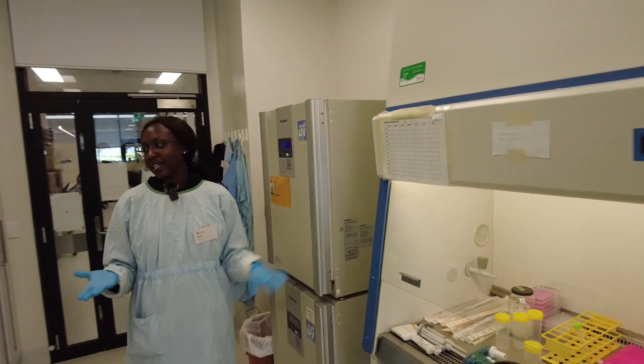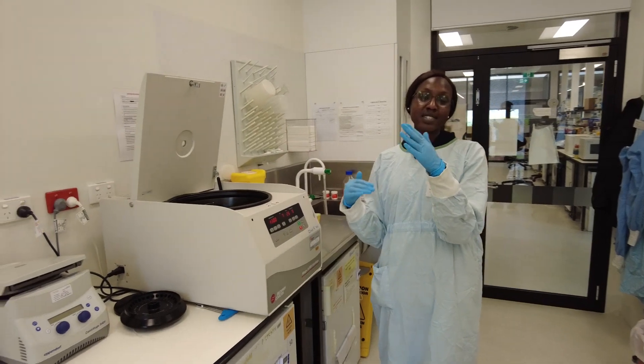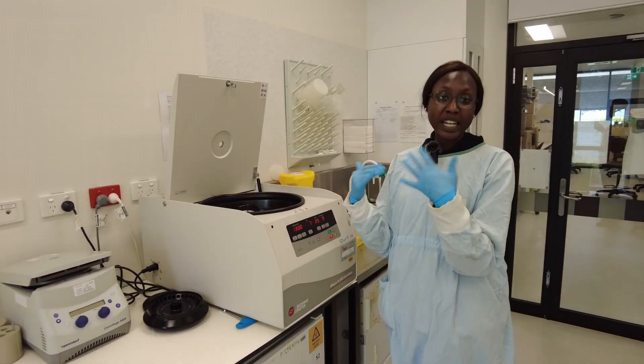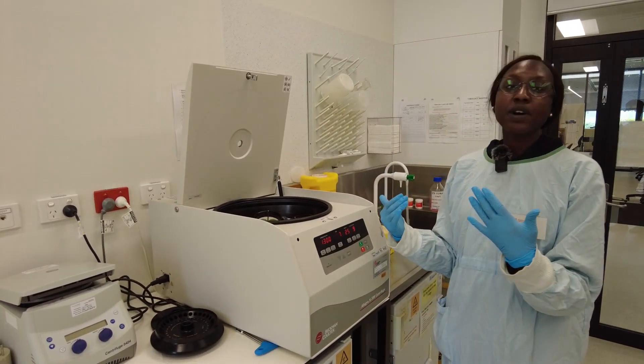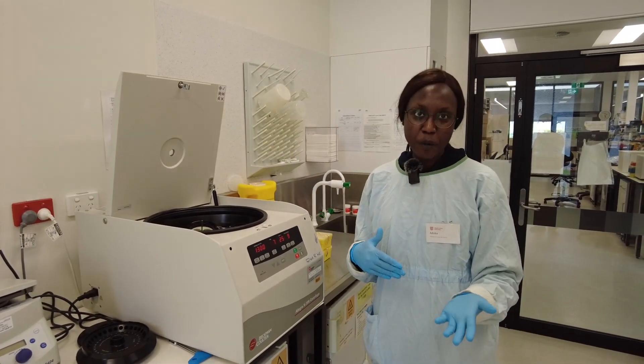The second equipment that we need is a centrifuge. The centrifuge allows us to separate our cells from the supernatant or media that they're in. It allows us to know how many cells are in the flask so we can go on to the experiment.